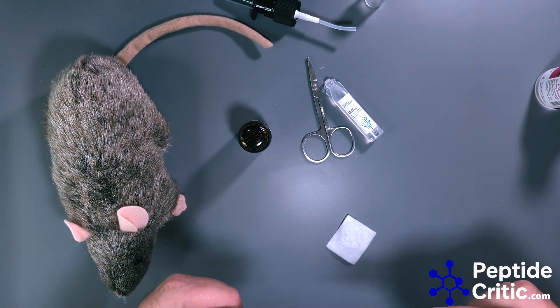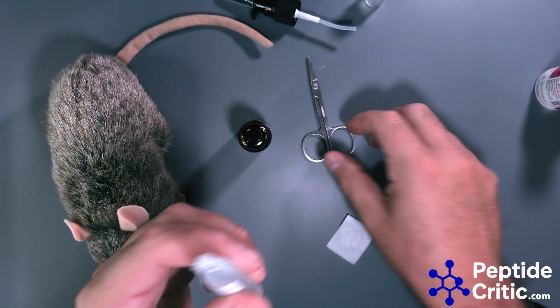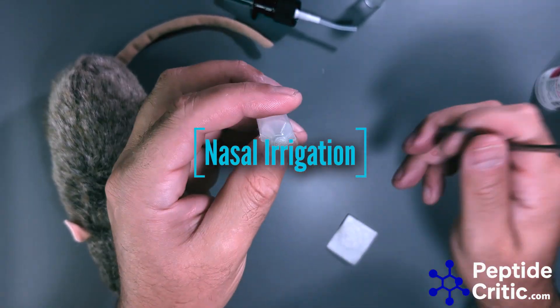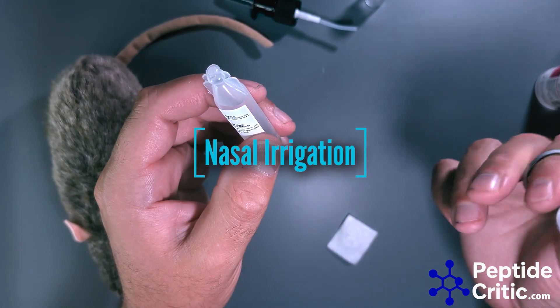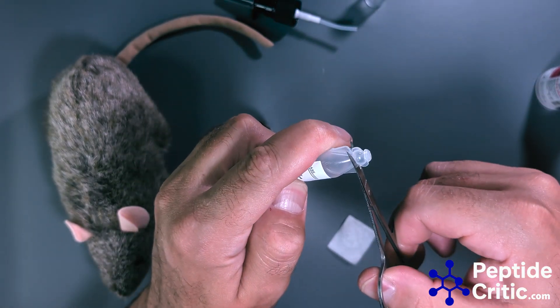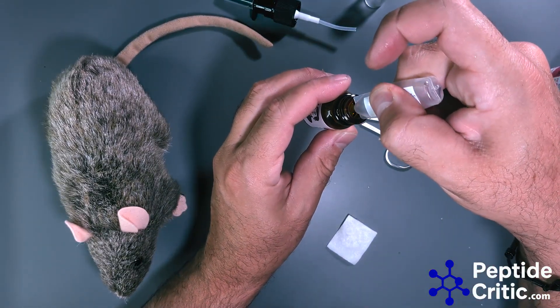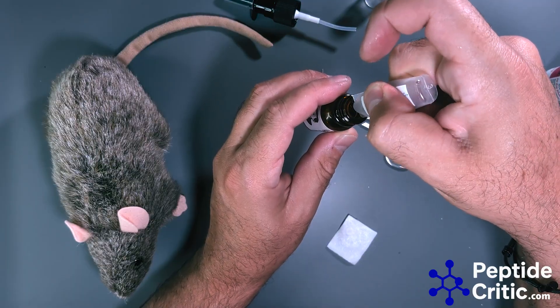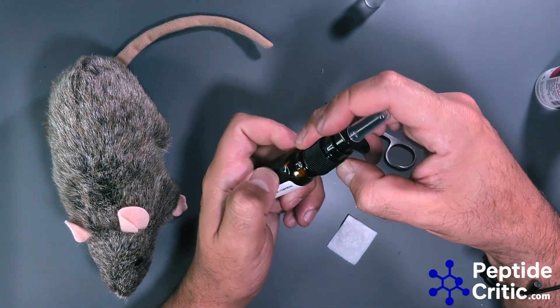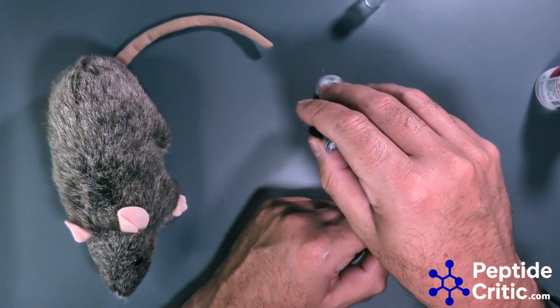This is 5 ml of saline solution — sterile, doesn't have to be injection grade but it has to be good enough for a nebulizer or nasal use. We're adding a section to our site where we link to all these supplies from third parties. We just add that into the bottle and we're good to go. Don't violently shake it, just mix it gently.